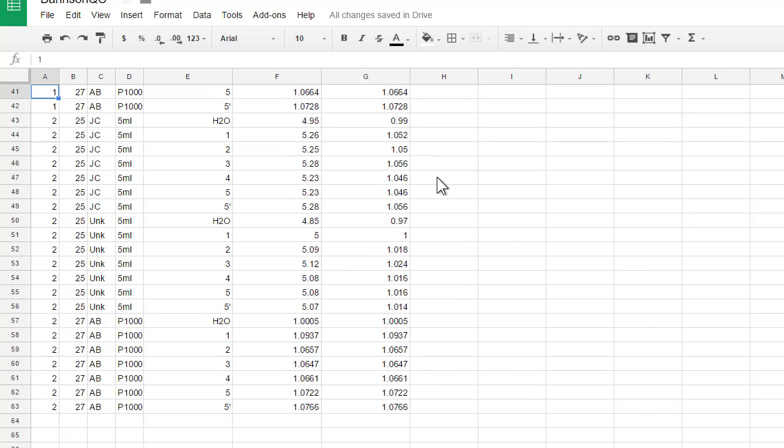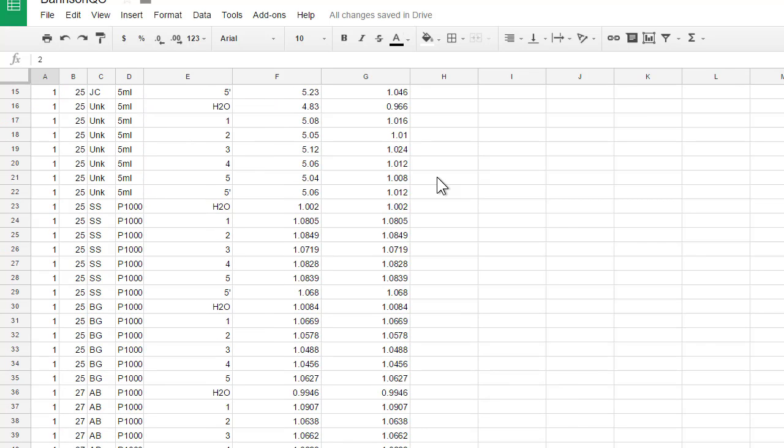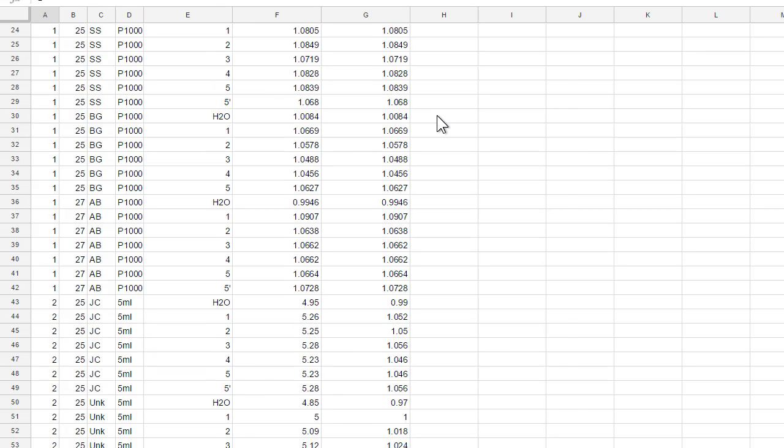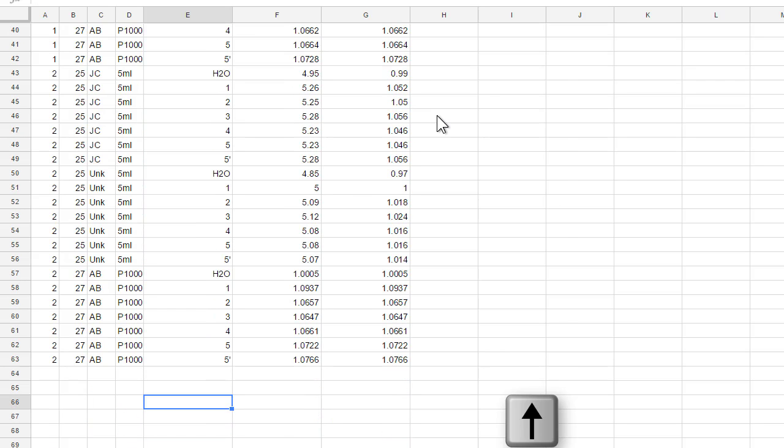So I did two replicates. I did one the first time through of all these same samples that you guys measured yesterday. Water should stay the same, but the other samples, 5 and 5 prime, had yeast added to them. They very well may have changed over a day. And these other four sat out open. All of these sat open to evaporation. That would have tended to concentrate things, but the yeast, making alcohol out of sugar, would have tended to reduce the specific gravity.